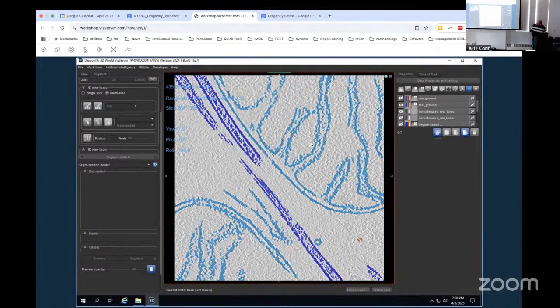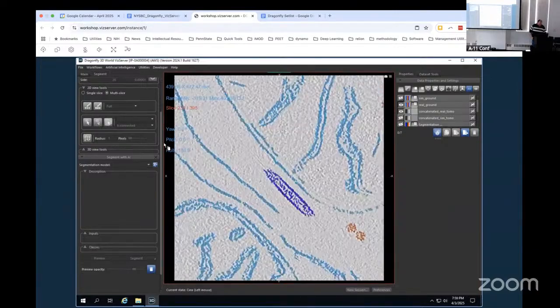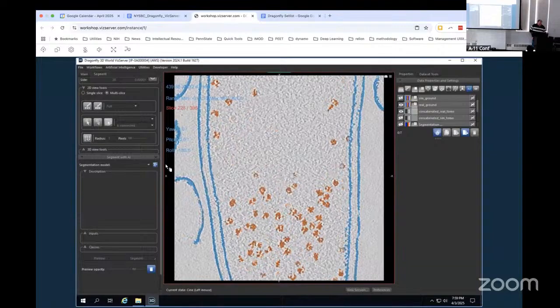We did have to hand segment a lot of these because it didn't know how to get mitochondria, right? There's nothing in our synthetic data that looks like a mitochondria. So we had to hand segment these portions just to make it work. What you'll also see in here, see there's a bacterium right there. All right.